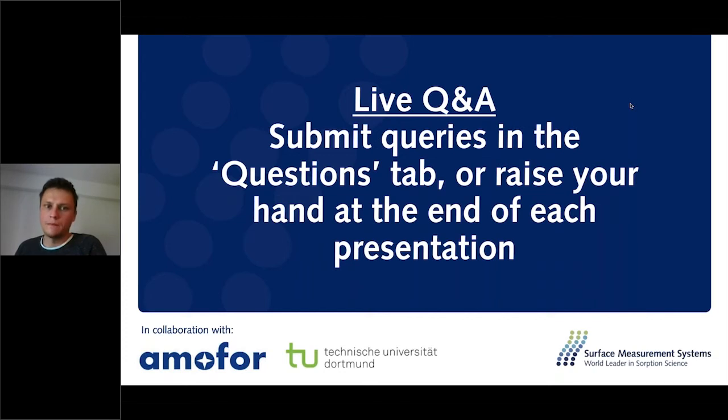Okay, thank you. Next question, how did you determine the API polymer intermolecular interaction? Yeah, this was determined by asking the in silico model and making the prediction for this specific mixture, for a given API polymer combination. The in silico model of the API is based on real solubility data that is taken to fit and train the model, and then we consider this interaction and calculate, for example, the activity and the interactions in a different environment, like in a polymeric matrix. And by that, we obtain these interactions.